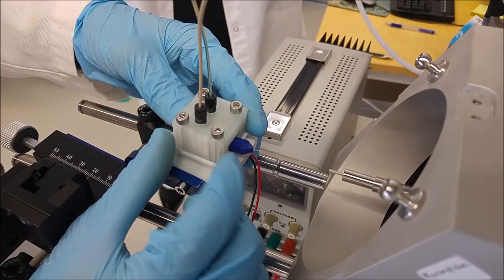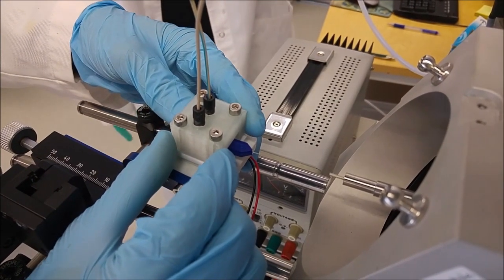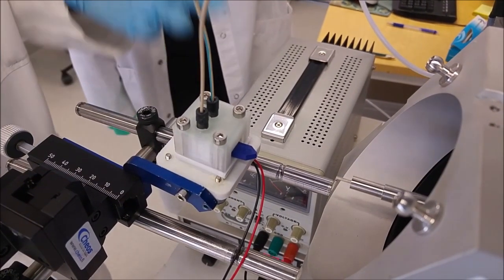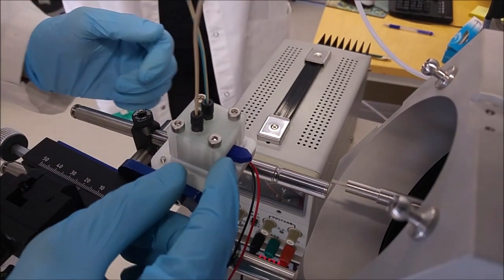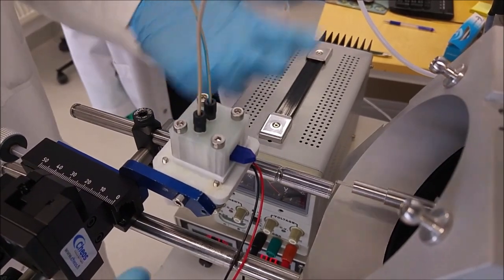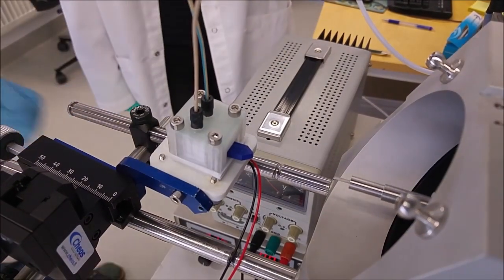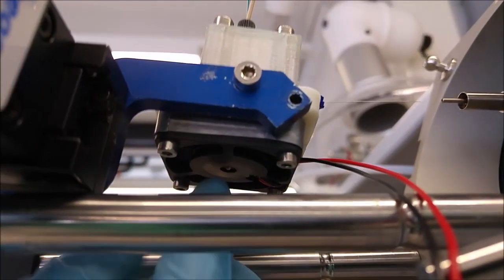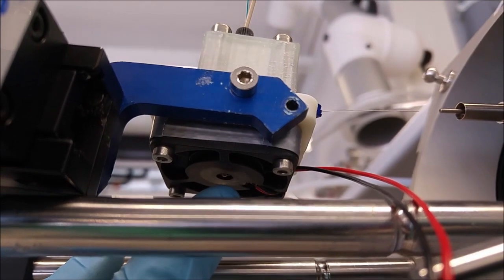The micro-reactor is inserted in a measurement jig that is connected to these syringes. This measurement jig has also been 3D printed. So this project has saved a lot of money by 3D printing not only the micro-reactor but also part of the experimental instrumentation.